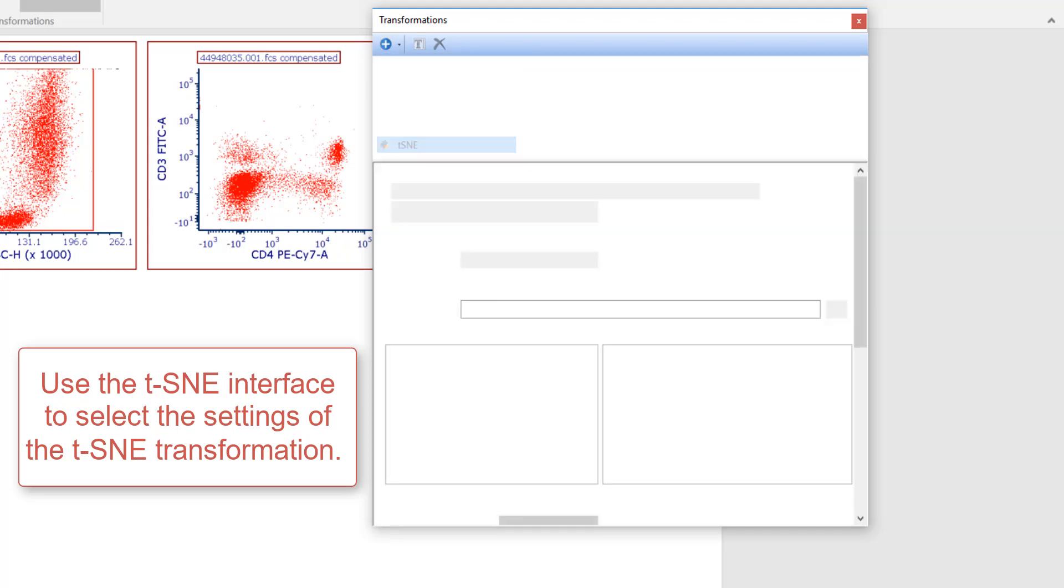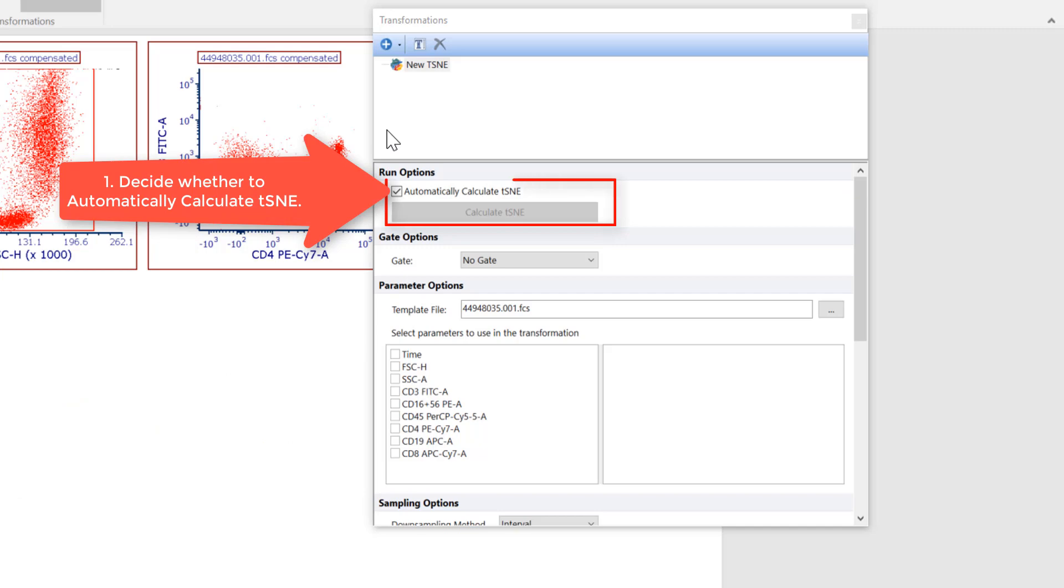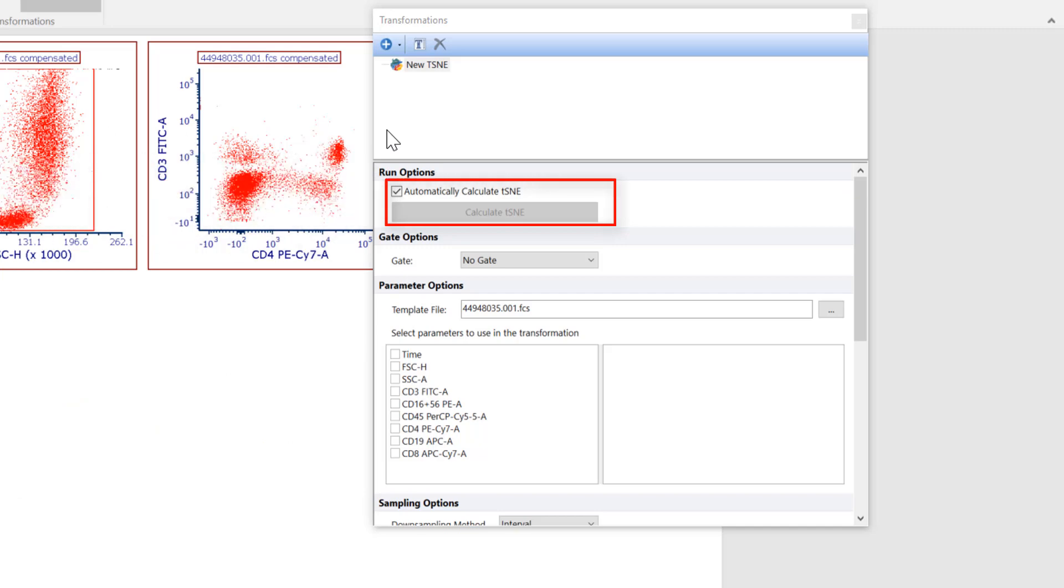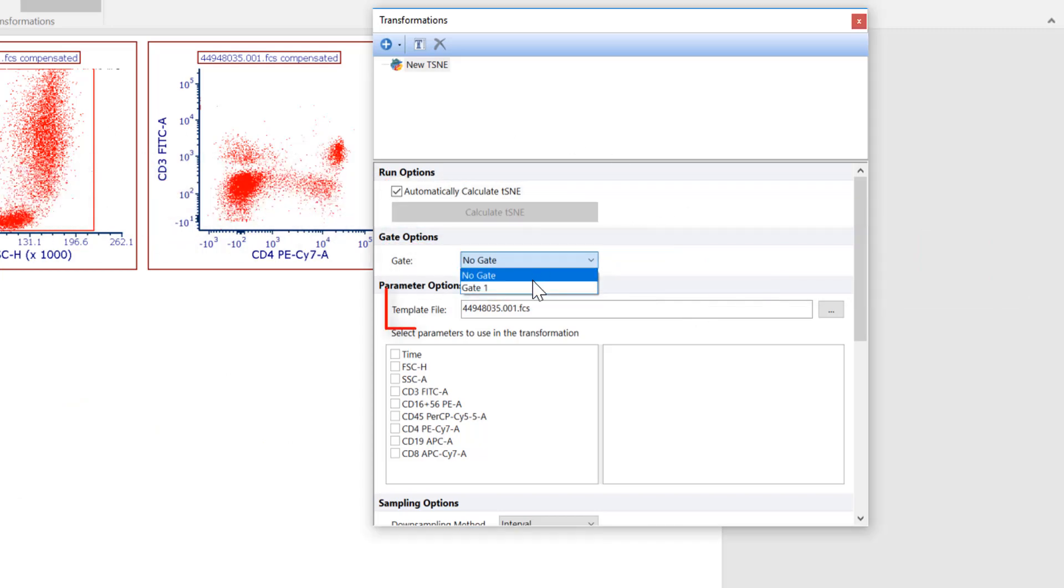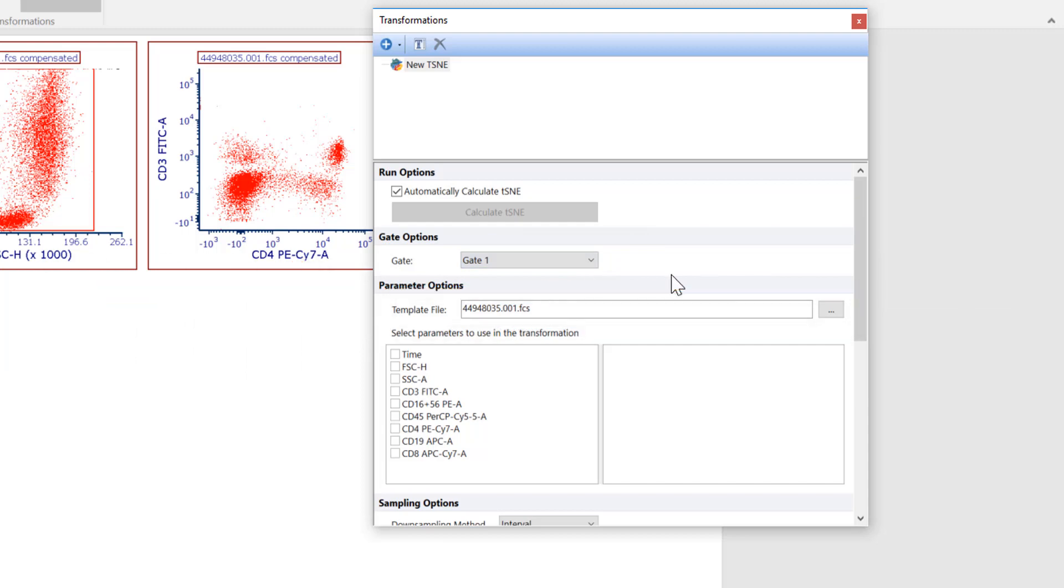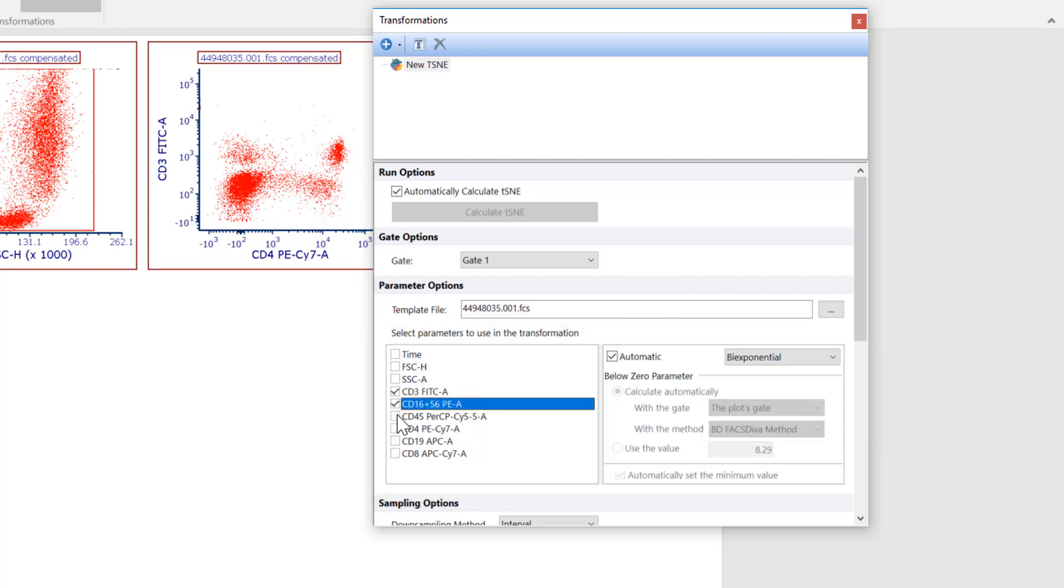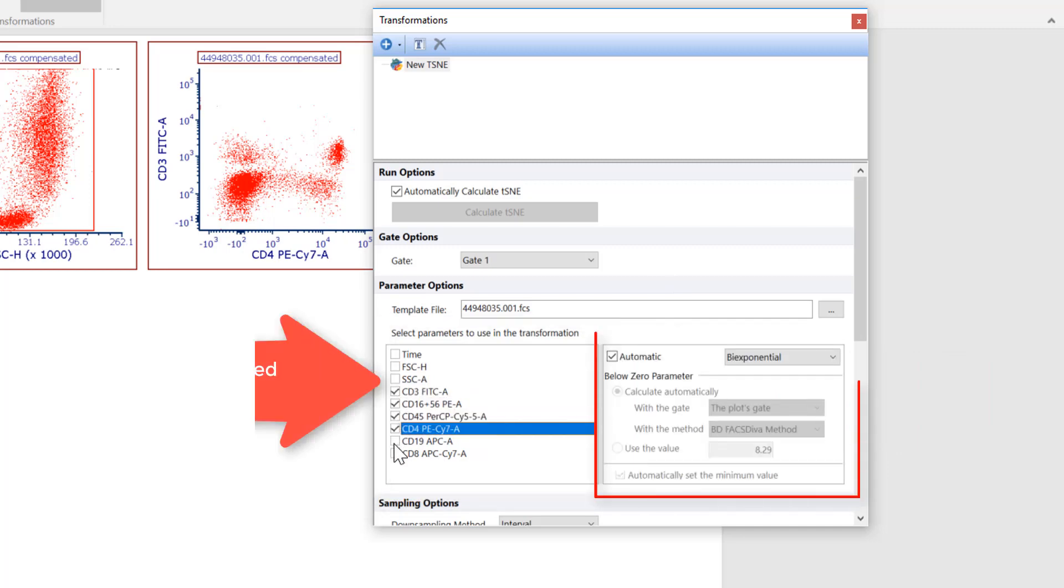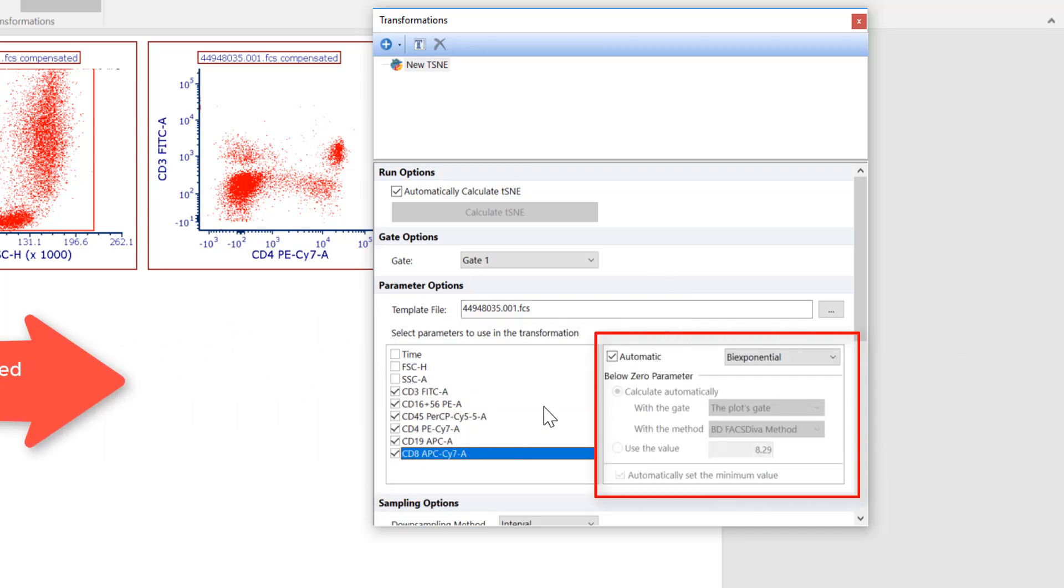This is where the settings of the t-SNE transformation will be selected. We can decide to automatically calculate t-SNE, apply a gate from our layout, select a template file, select the parameters to be contained within the transformation, and then the axis scaling for each of those parameters.